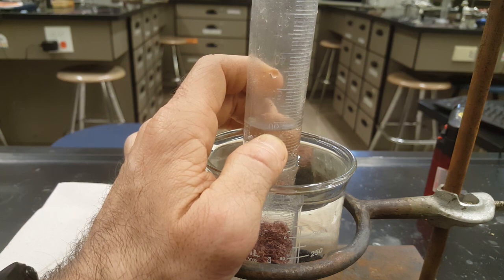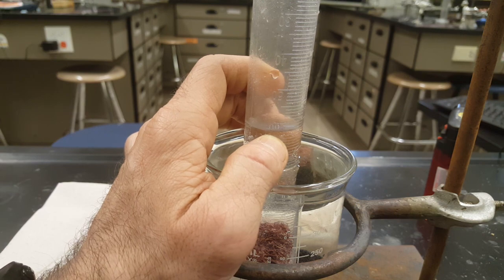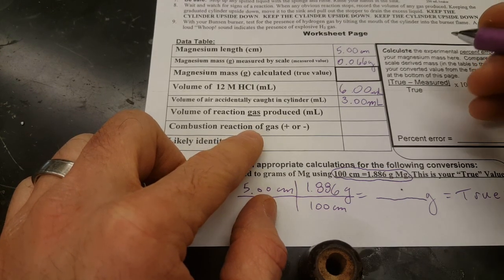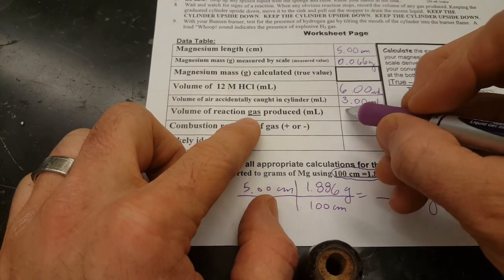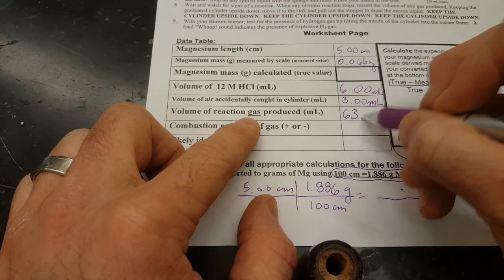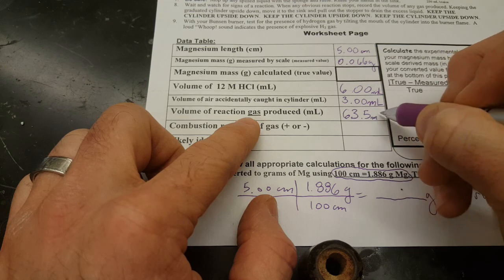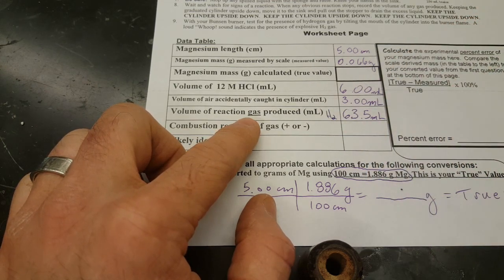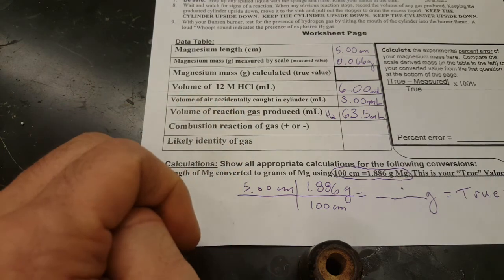So I've got 1, 2, 3, 63.5. And that 63.5 I'd write right here, 63.5 milliliters, and I think that it's H2, and we can test that next.